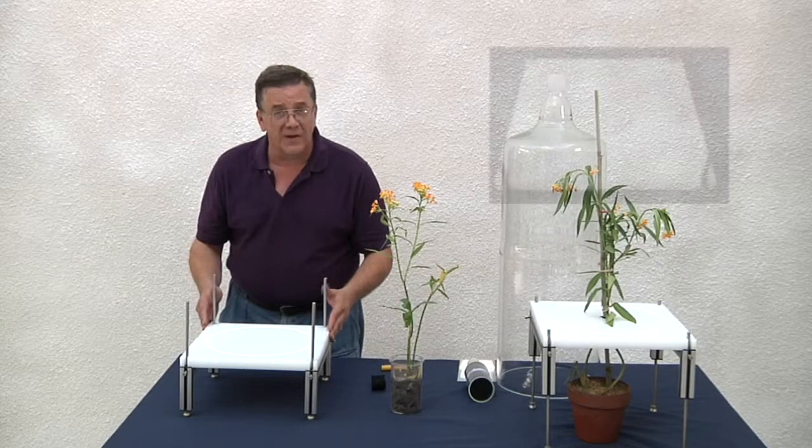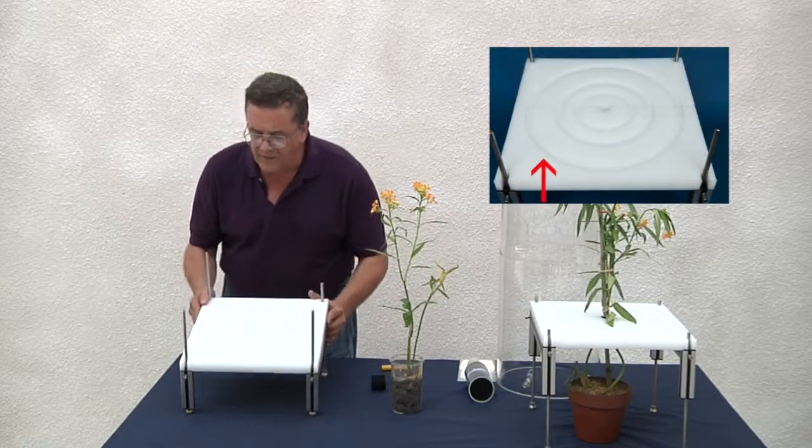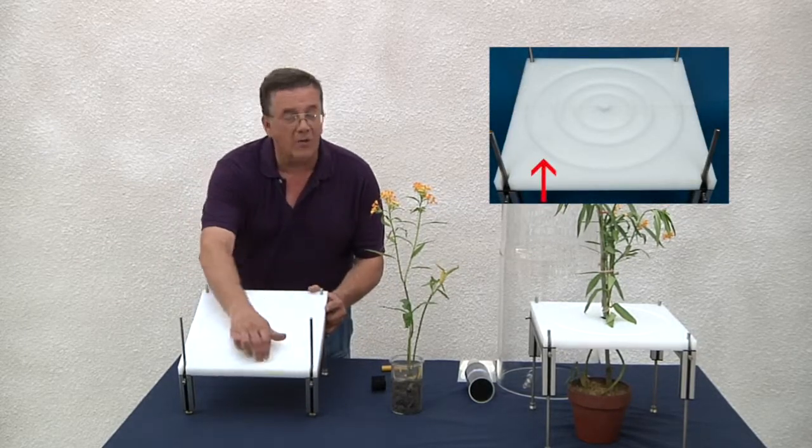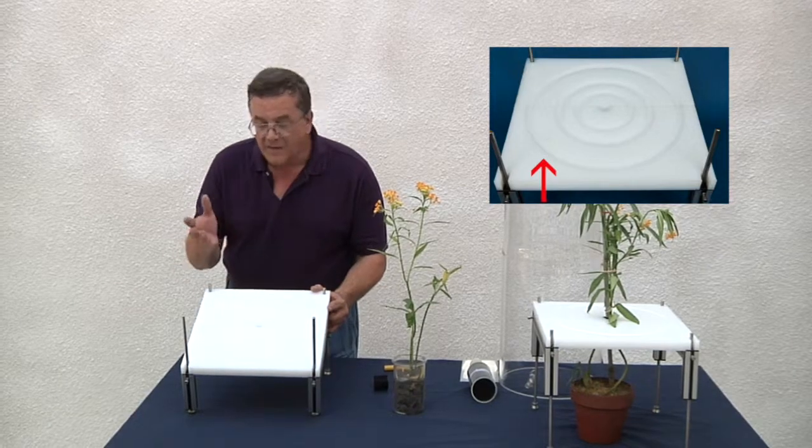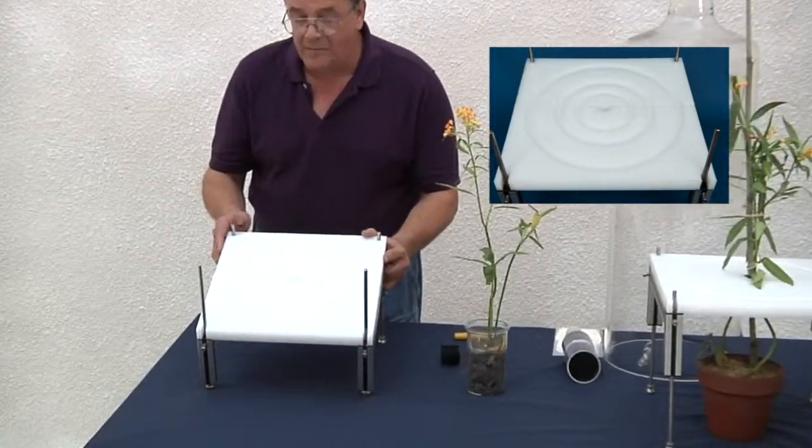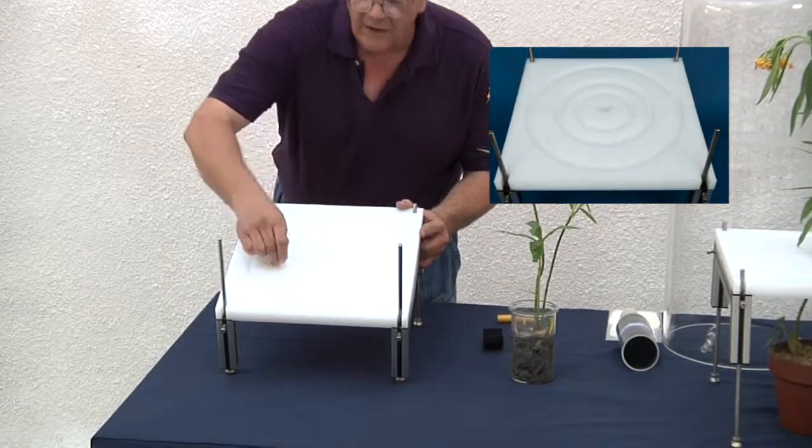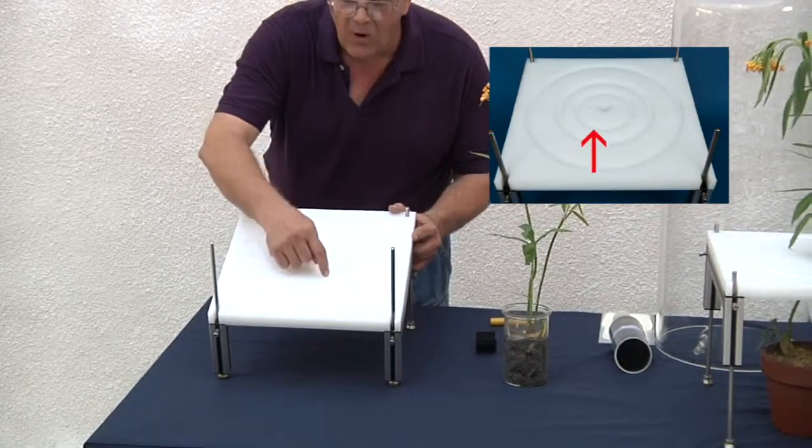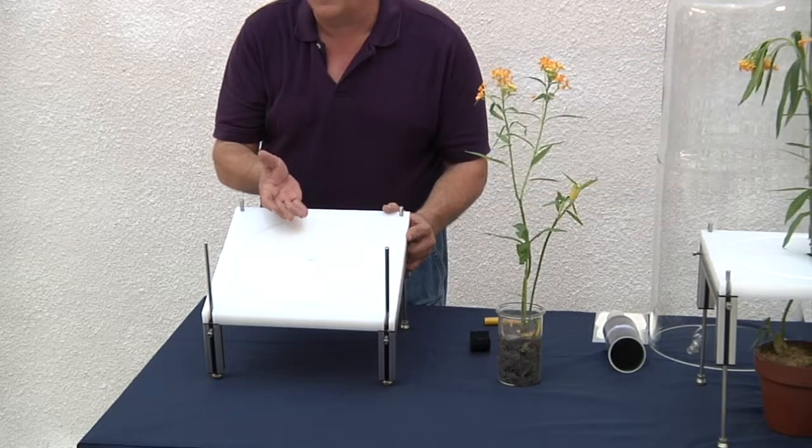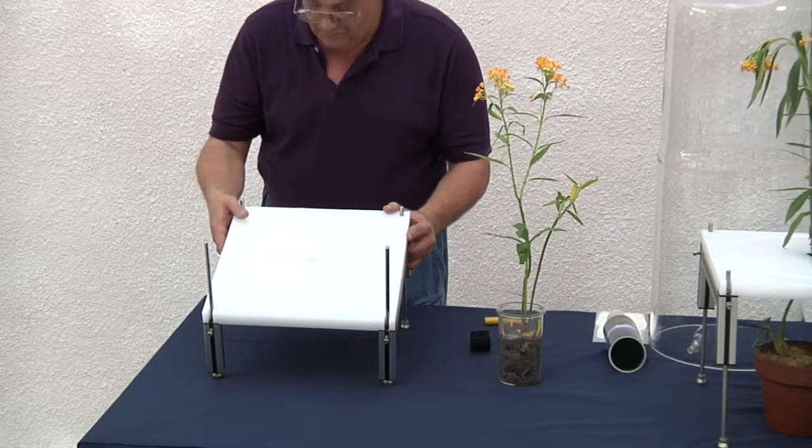This is our large stand. It has a 300 millimeter ring for our large glass chambers. The nice thing about our large table is we can also cut in a 200 millimeter ring and a 100 millimeter ring so you could use the same table for different glass chambers.